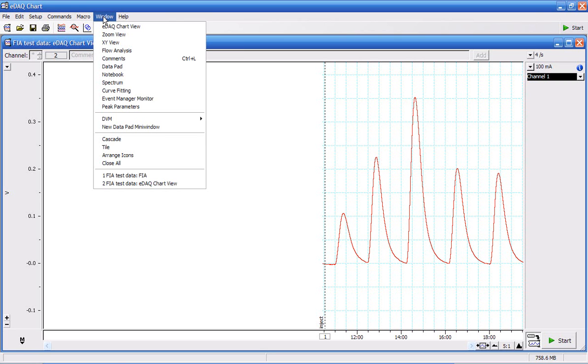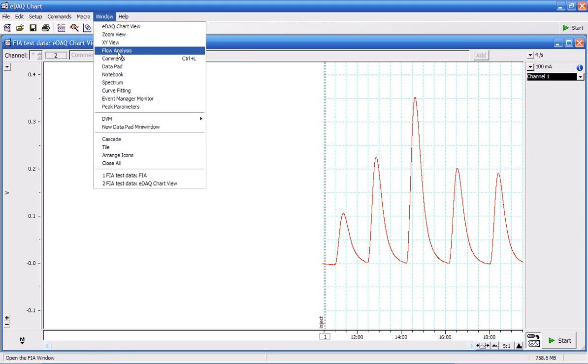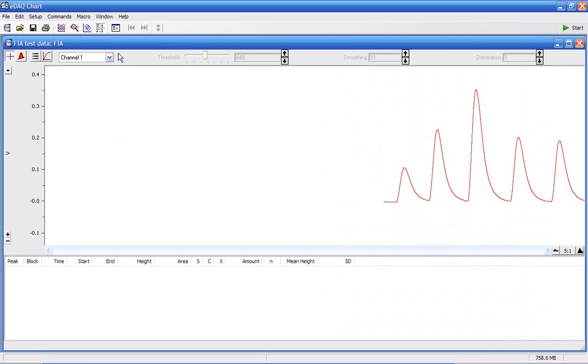In the windows menu, there's now a flow analysis option. Here are my peaks.